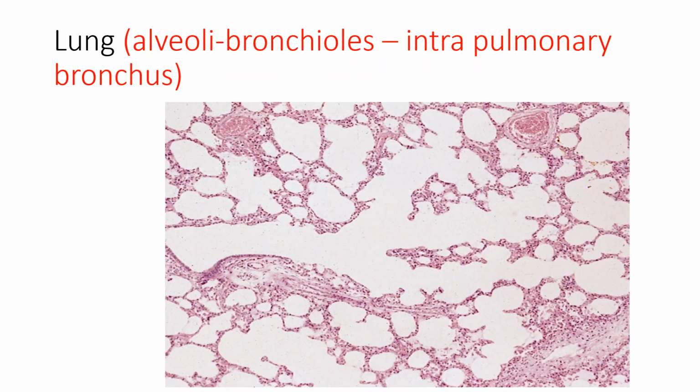A sponge-like structure, we are talking about the lung, the adult lung. These are the alveoli. Here the alveolar sac. Here is the terminal bronchiole, respiratory bronchiole, alveolar duct. Okay, you just say it is lung.